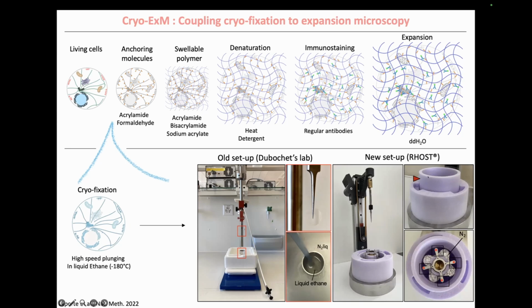So this will just rise up, floating on top of the liquid nitrogen, and then you just plunge here in the middle of this element. It's pretty convenient to use this one, although I really like that I developed the project using the Jacques Dubochet one, the Nobel Prize for cryo-EM. We were lucky enough to have this in our lab.